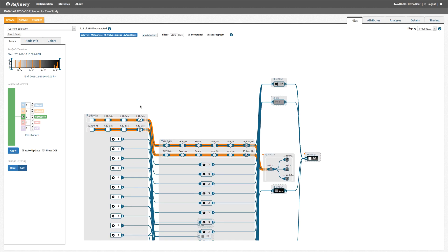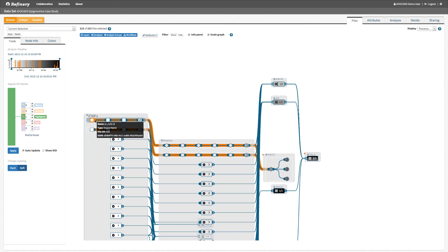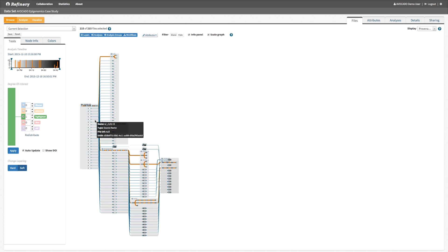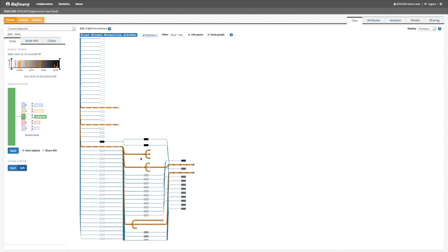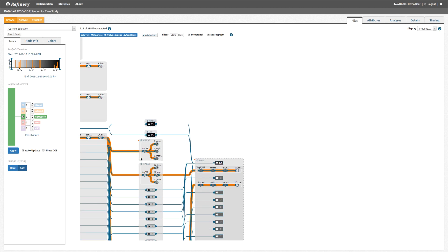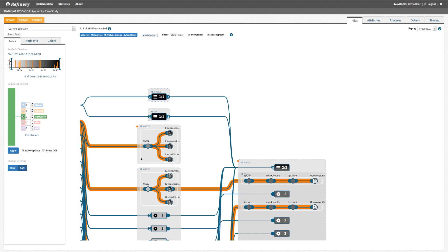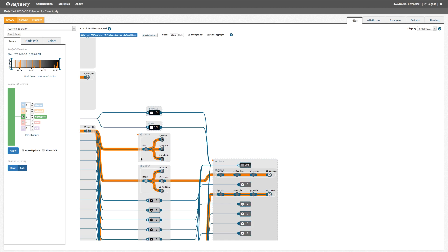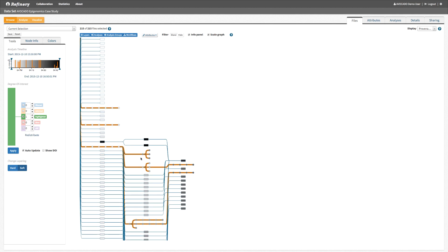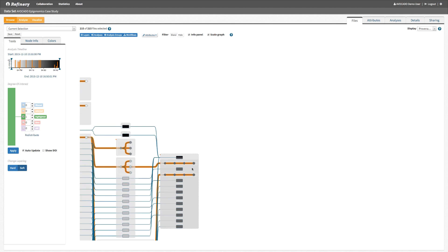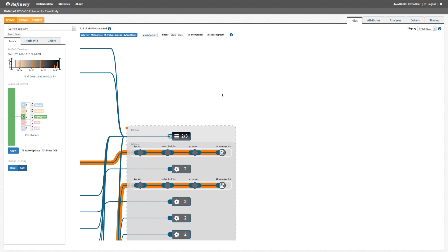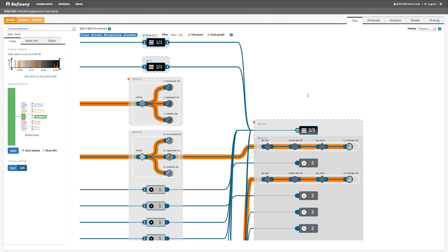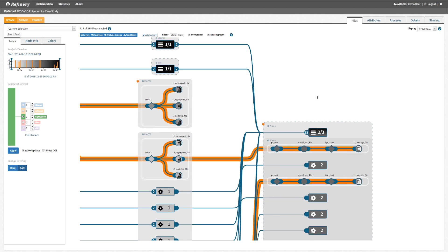We can also revert this functionality and trace all the output files generated from a raw data file of interest. For example, we observed that this raw data file was run through the macs2 workflow twice. But only one of the two macs2 results was passed on to the pileup workflow.